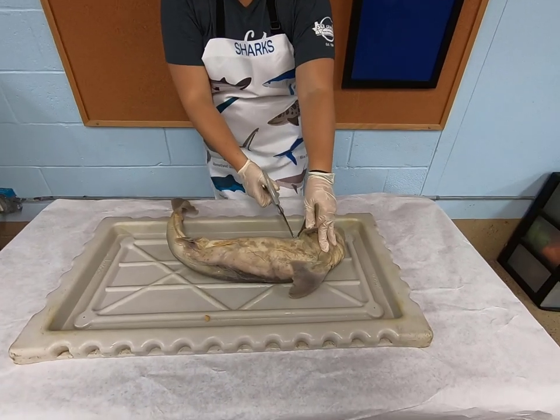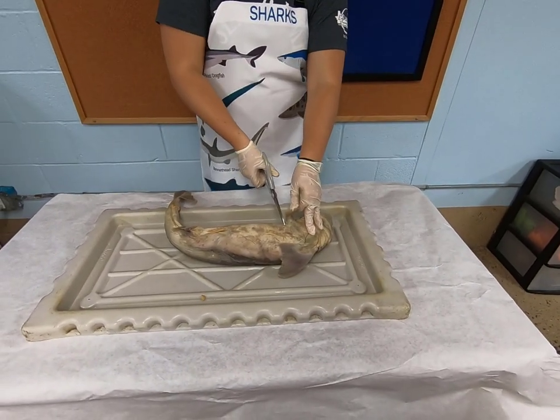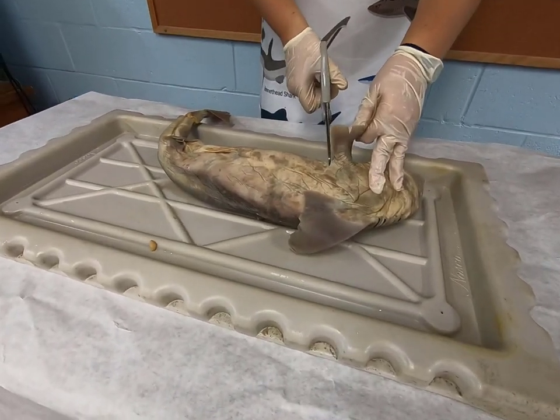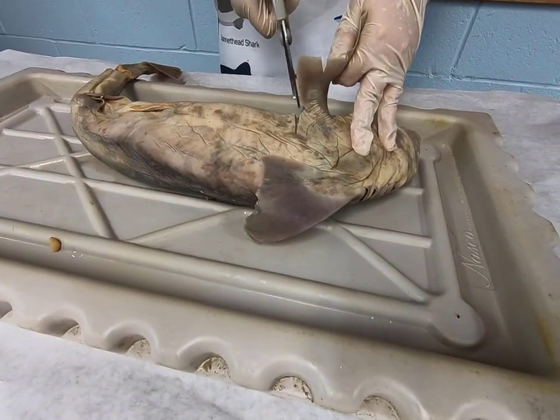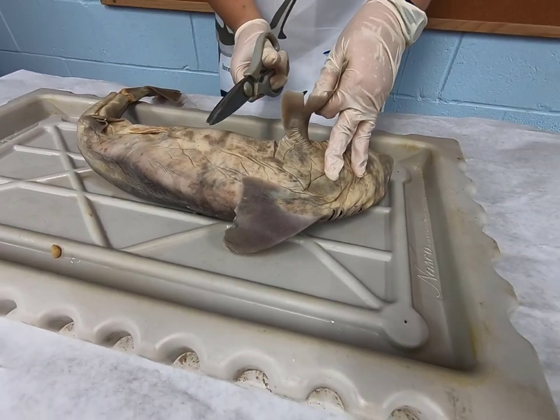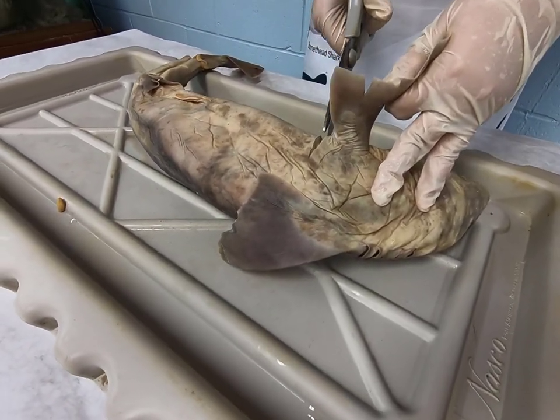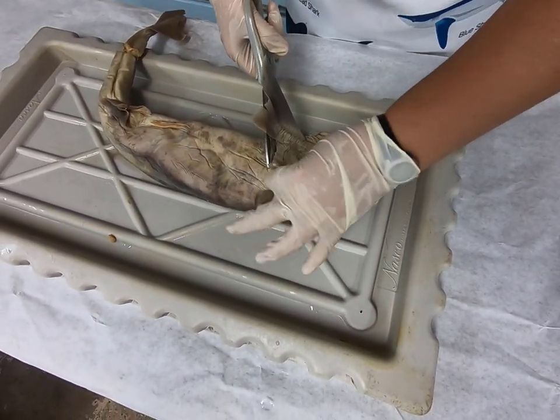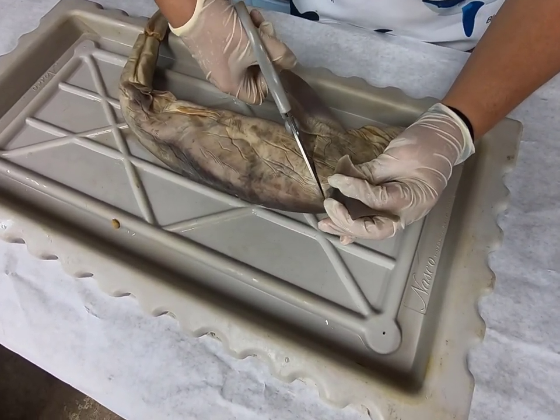So whenever we cut the shark, sharks have very thick skin. They don't really have a lot of fat to them. They have really thick skin. So I'm cutting, we always say armpit to armpit, even though these are our pectoral fins, like we learned, right? So we cut from armpit to armpit, pectoral fin pit to pectoral fin pit.